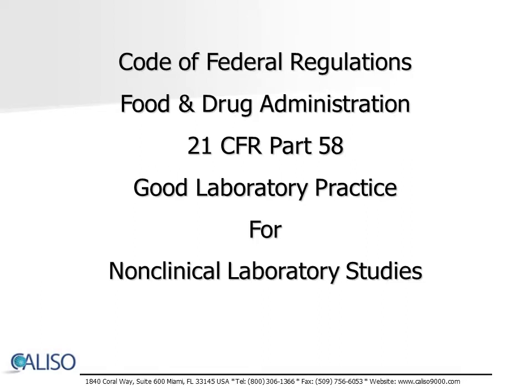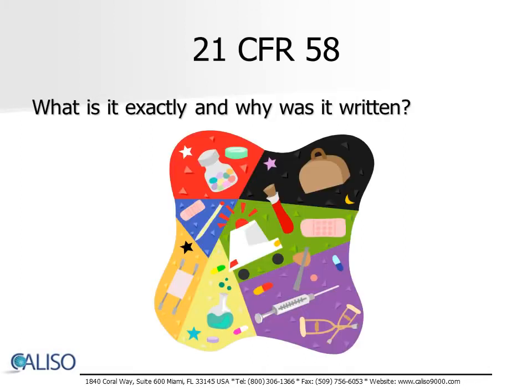This short video clip is presented to introduce you to some basic information on the requirements of the Code of Federal Regulations, Food and Drug Administration, 21 CFR 58, Good Laboratory Practice for Non-Clinical Laboratory Studies.